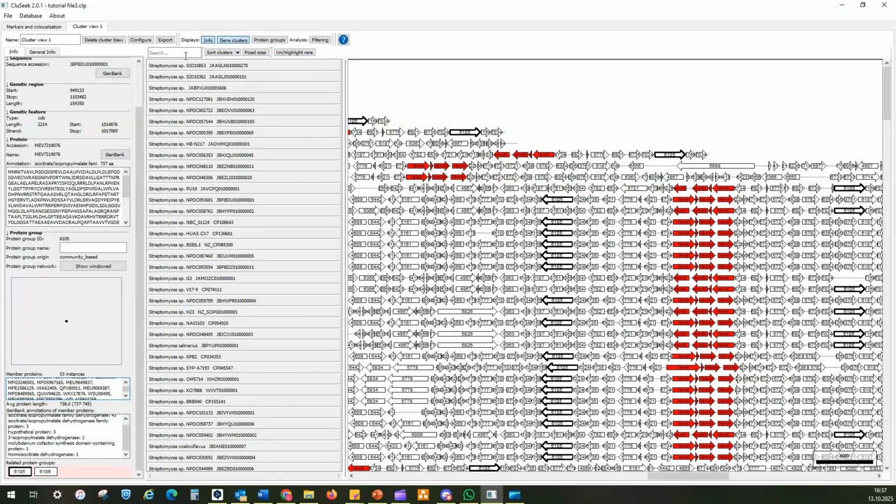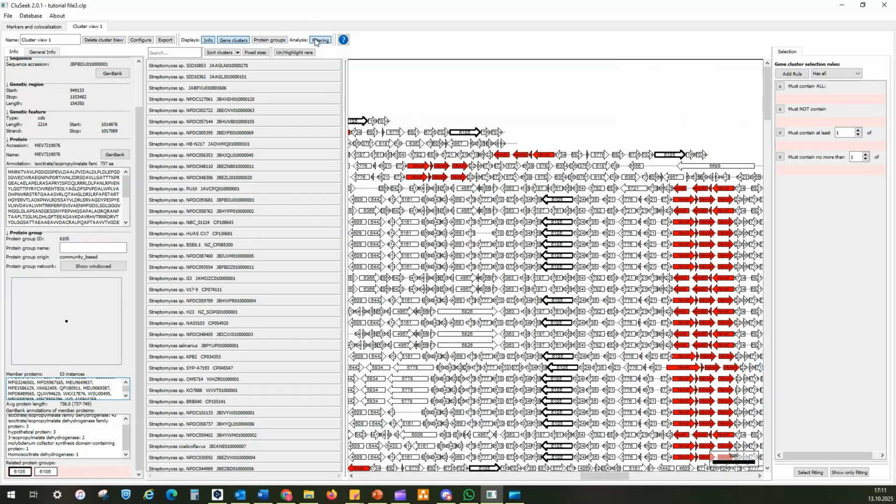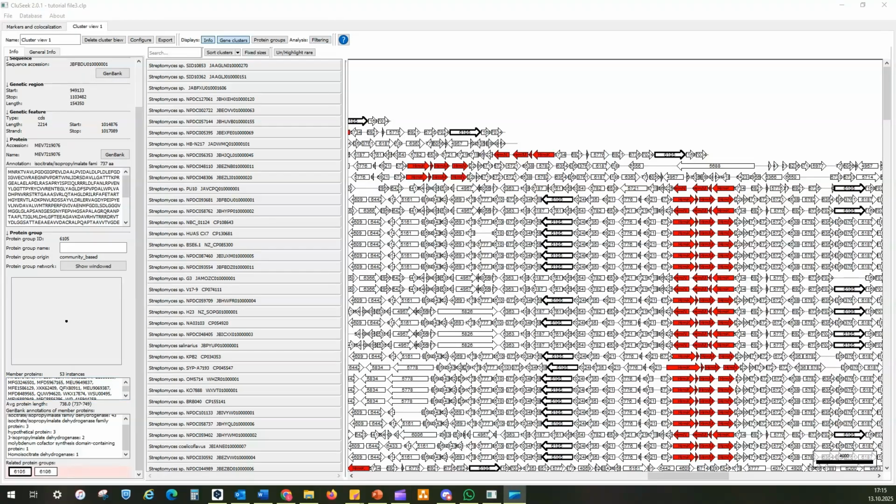The Gene Cluster subtab contains the list of species in which the identified gene cluster is present. Here you can show and hide further subtabs. We will describe them step by step. You can easily adjust the size of each window.